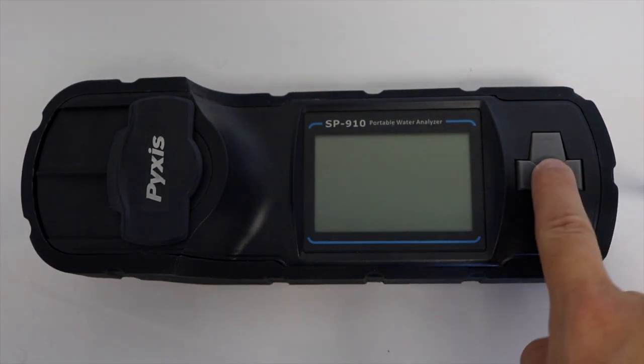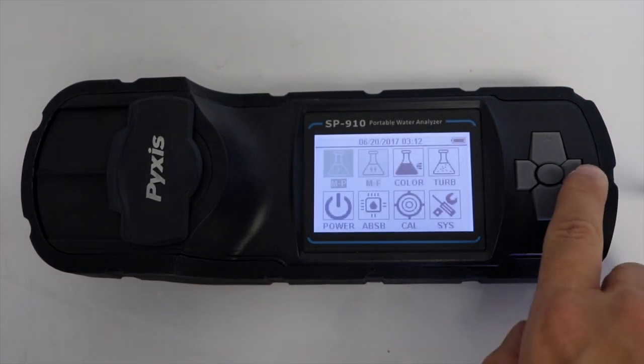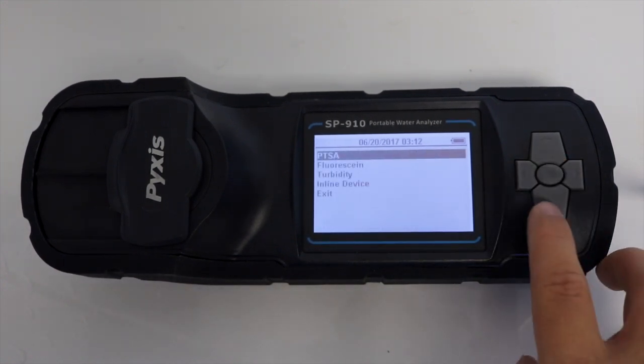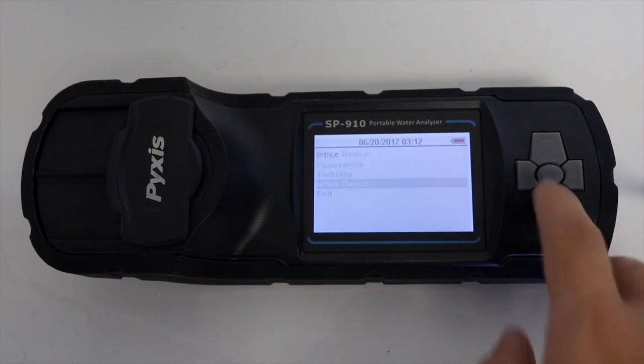Use the center key to turn on the SP910 unit and select the CAL option in the main display menu. Then select inline device.